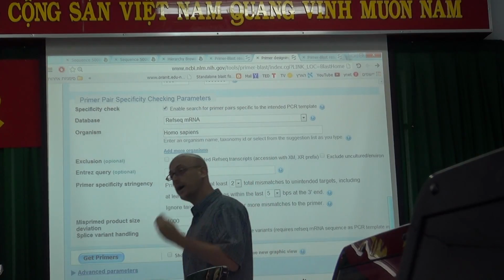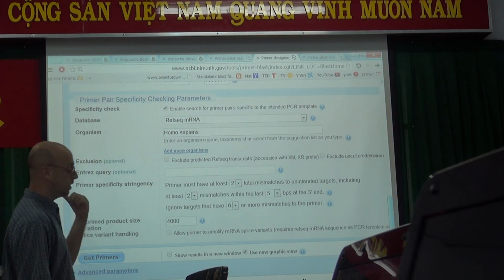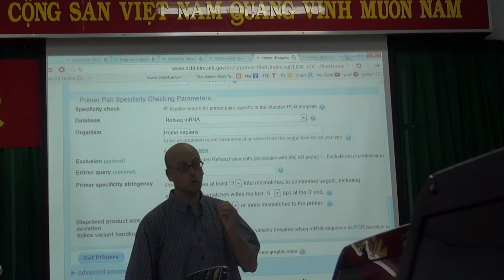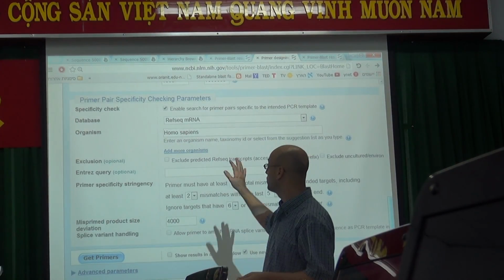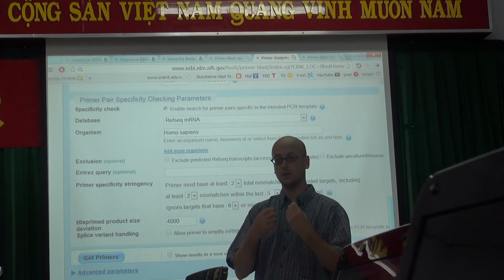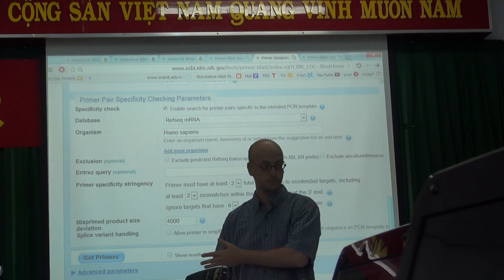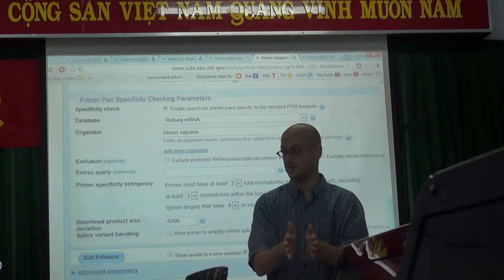So, when we search in the rhizosphere for Azospirillum brasilense, we want to find only Azospirillum brasilense. We want to know that our primer pairs are specific, that they will not give us other bacteria. They will give us only Azospirillum brasilense.